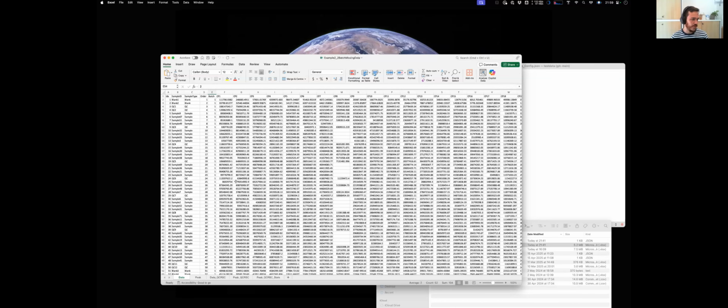So another question from Harry: An excellent talk. I'm wondering what's the minimum sample size required to achieve a reasonable result from your algorithm? So to make sure that the model is converging. I think you touched upon this already. But the question is basically if there is a minimal sample size that is required to achieve good performance.